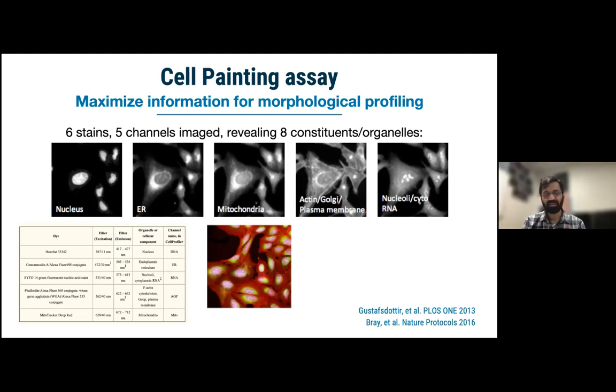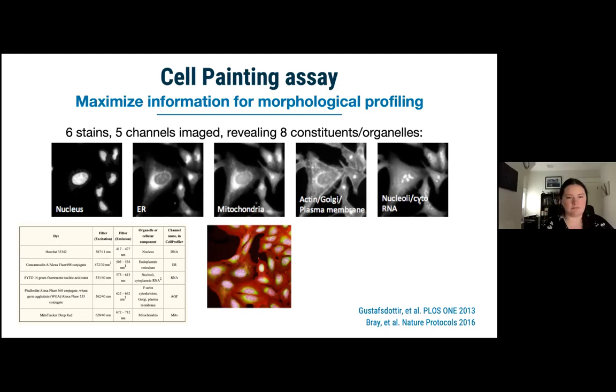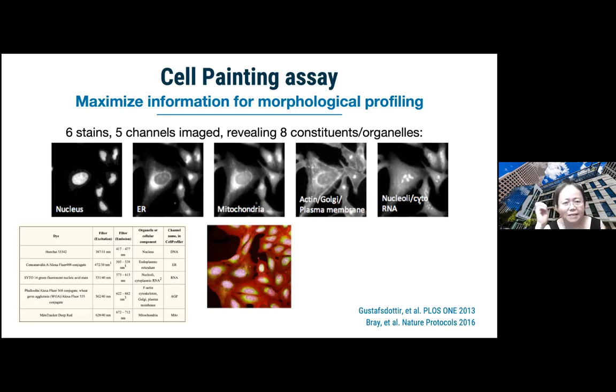Well, that's fantastic. Does anybody else have any further questions? Go ahead. Yeah, so my lab has developed genetically encoded calcium sensors to report on subcellular calcium dynamics. So have you applied your methodology to follow calcium signaling?